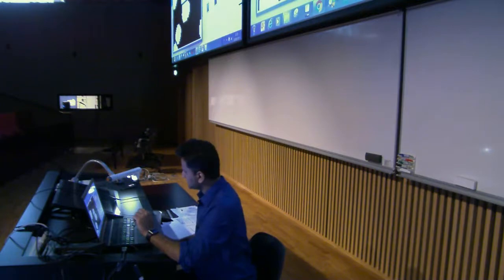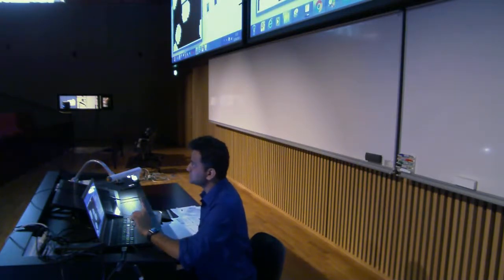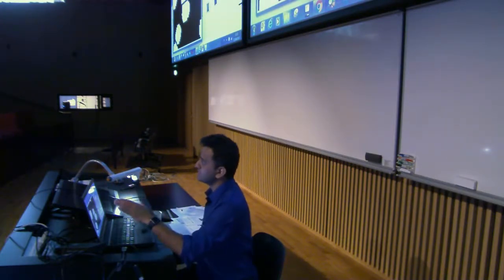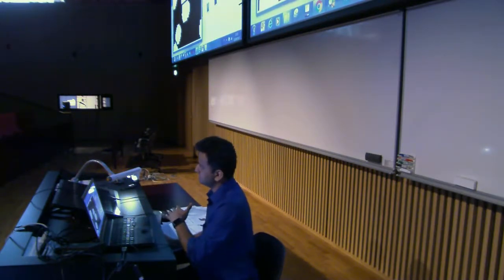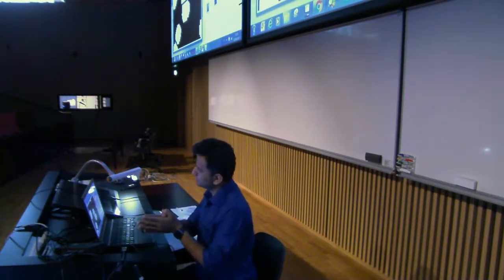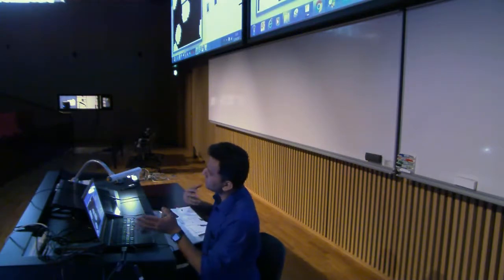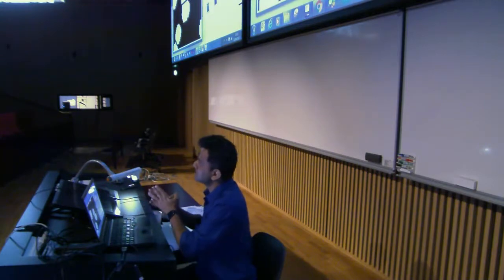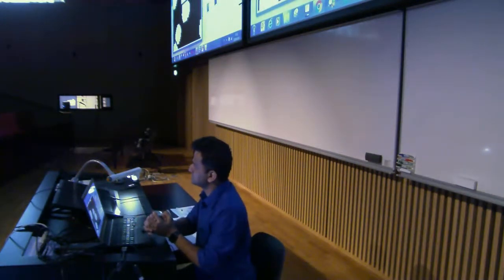But it is allowed to set segmentation parameters separately for two different conditions, as long as you are blinded to the conditions. So I can have auto thresholding for every image, because every image is different. Maybe the acquisition conditions were different. As long as you do not tell your algorithm that this is my control experiment and do this thresholding because I know the output, that is not allowed. But it is allowed to have different settings for different images and different conditions.